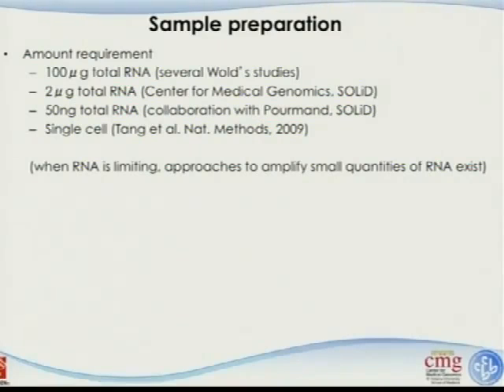And I'm going to give a few words about a paper published in Nature Methods, and they did a single cell RNA sequencing using the SOLiD platform. Okay, so when RNA is limiting, approaches to amplify small quantities of RNA really exist.